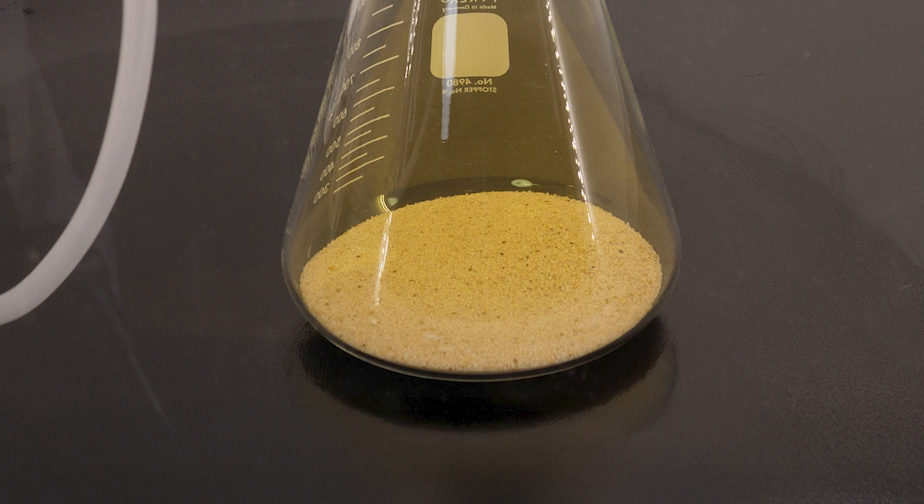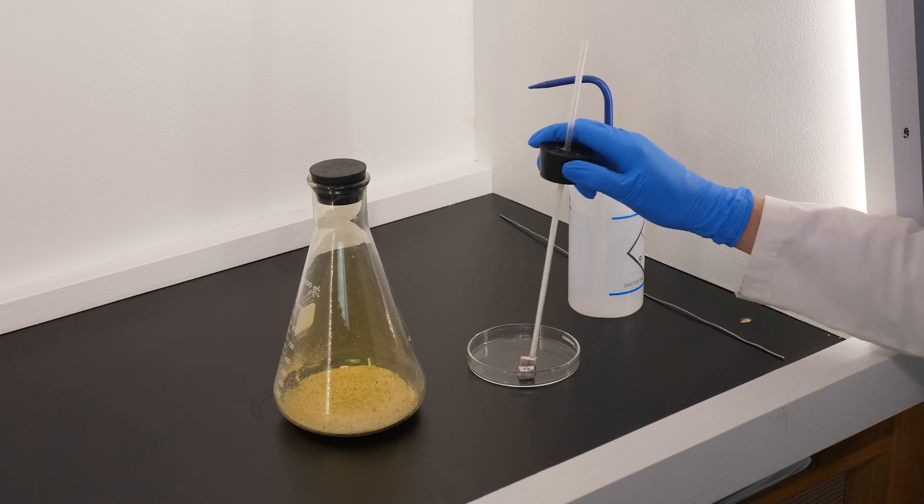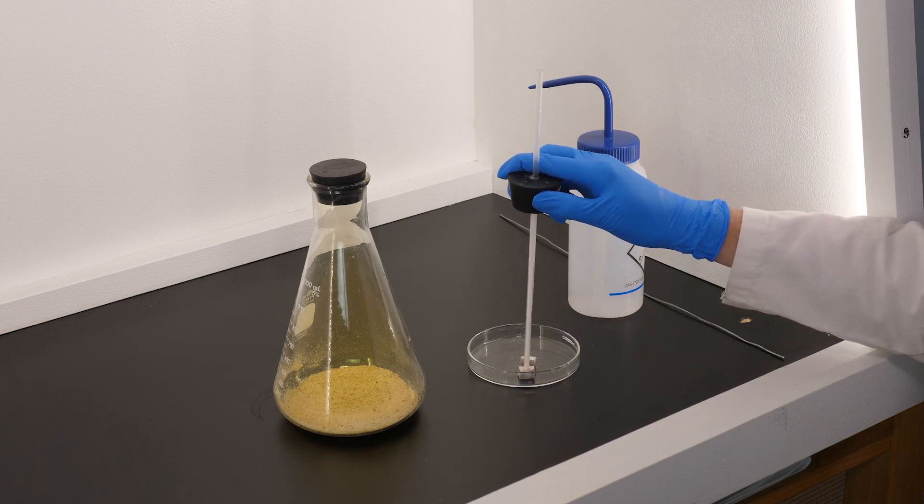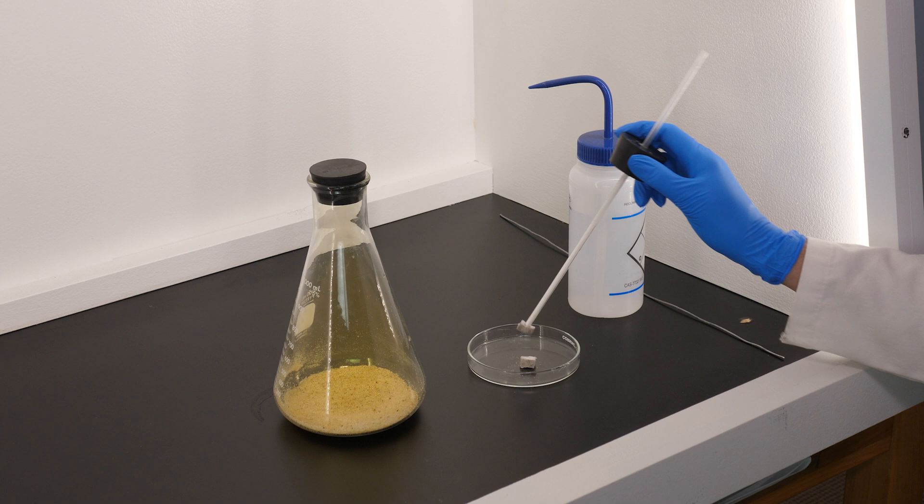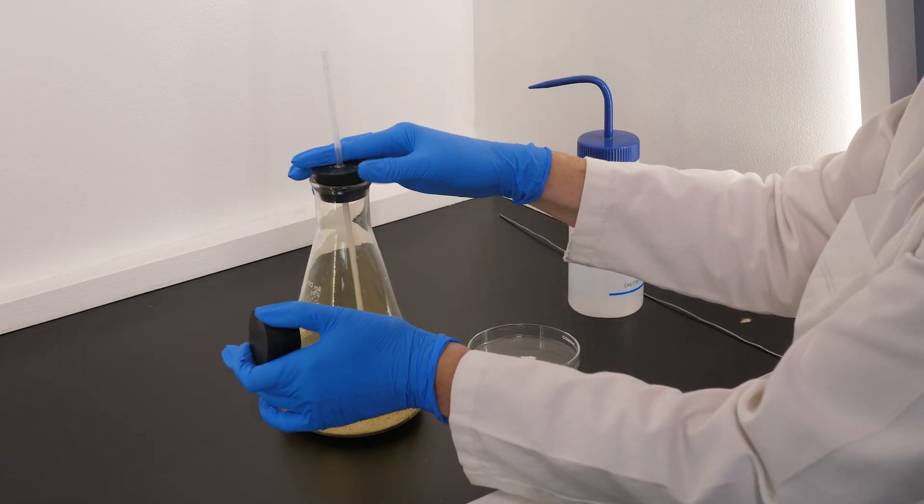Notice the sand in the bottom of the flask. During the reaction of sodium with chlorine, energy will be released in the form of heat. Sand has been added to the bottom of the flask to absorb some of the heat. Now, we will pick up a tiny piece of sodium with the glass tube. Since sodium is so soft, it will stick in the tube.